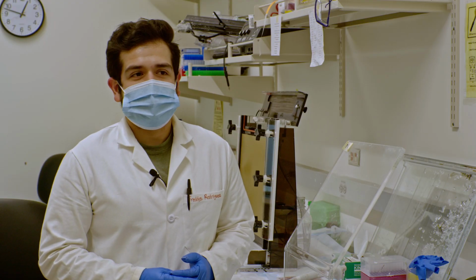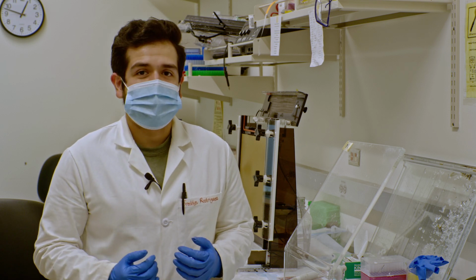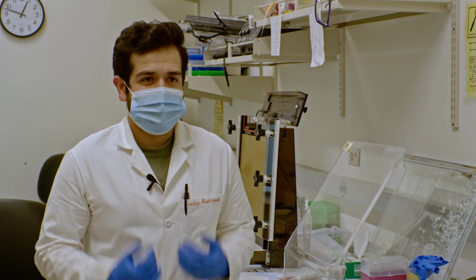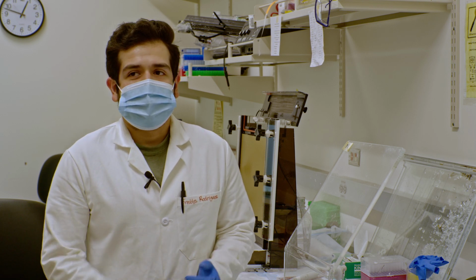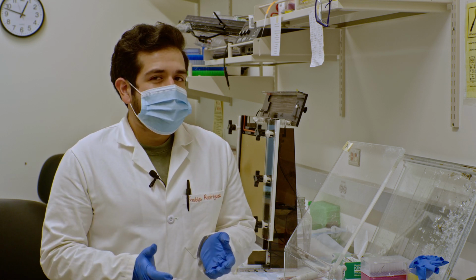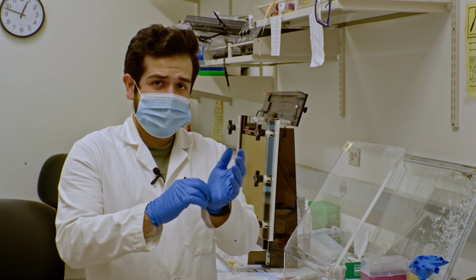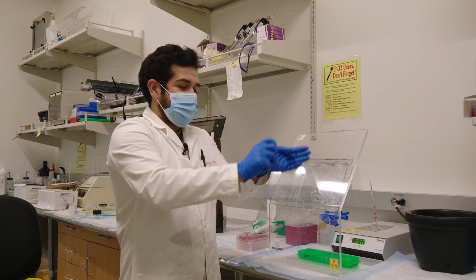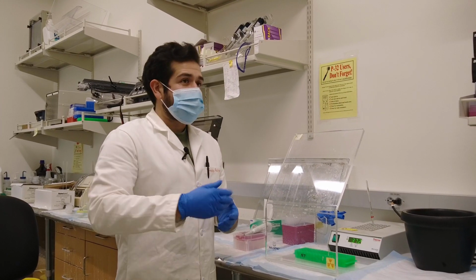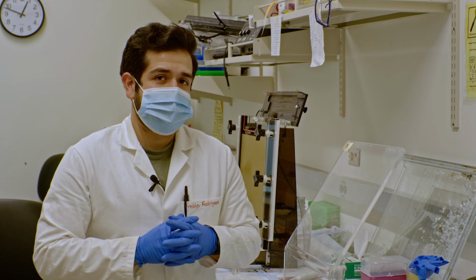Let's talk about a few things before we even start this experiment. So, proper lab safety. What you'll need is to always be wearing your lab coat. No matter what you do, always be wearing this lab coat. Make sure that you also put on two pairs of gloves. Now, why put on two pairs of gloves? Well, in case any radioactive material compromises one of these gloves, you can easily take that pair off and throw it away, and then replace it with a second pair of gloves. You always want to have two pairs of gloves on your hands at all times in this room.